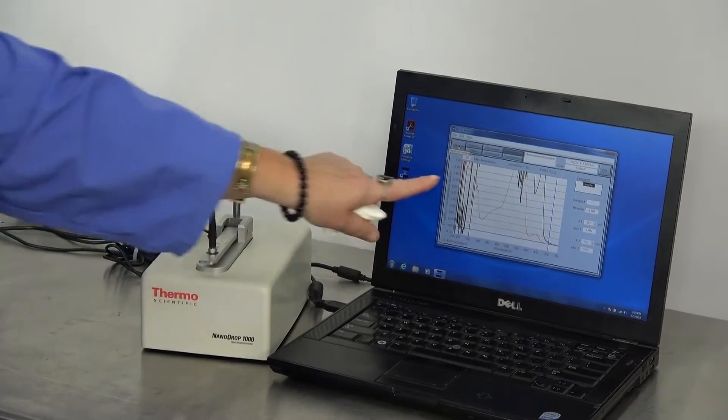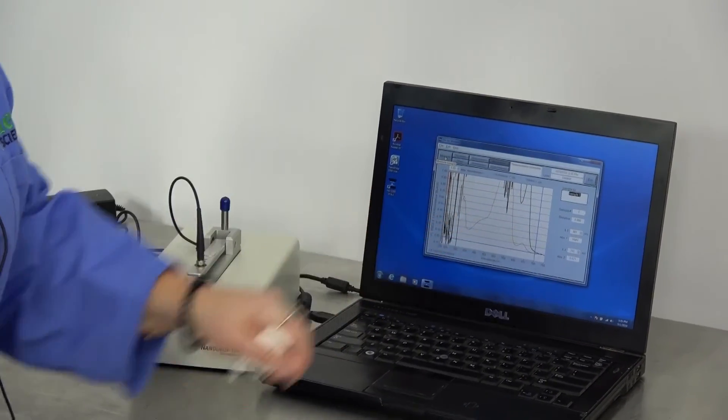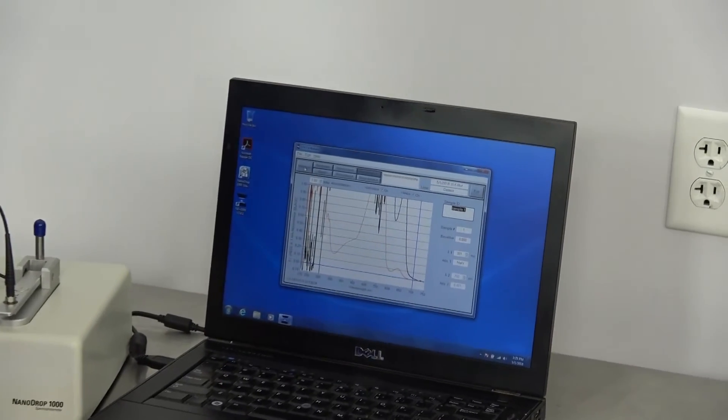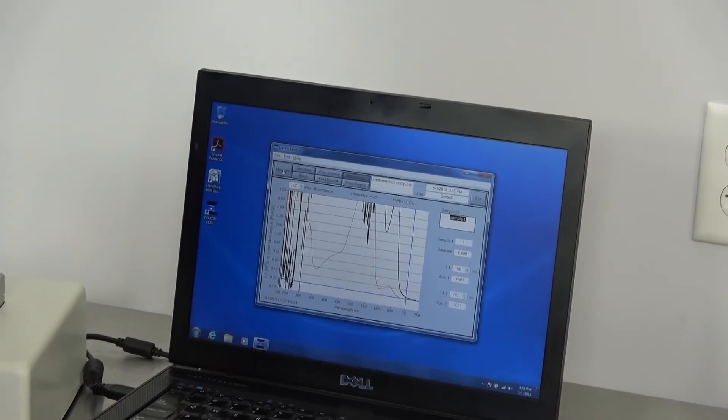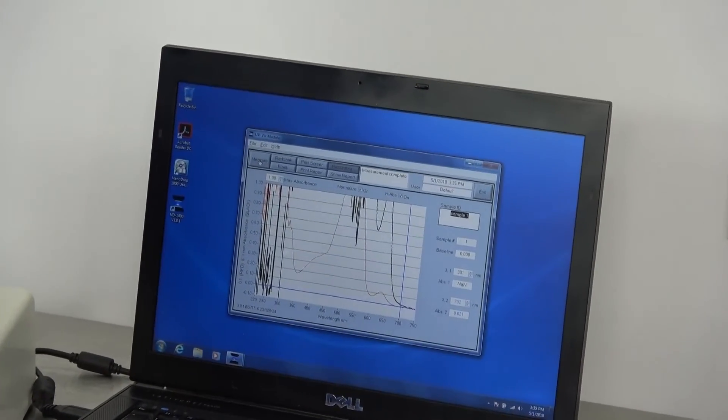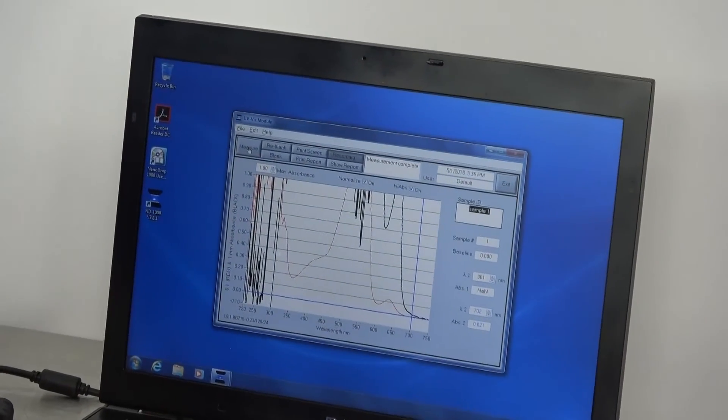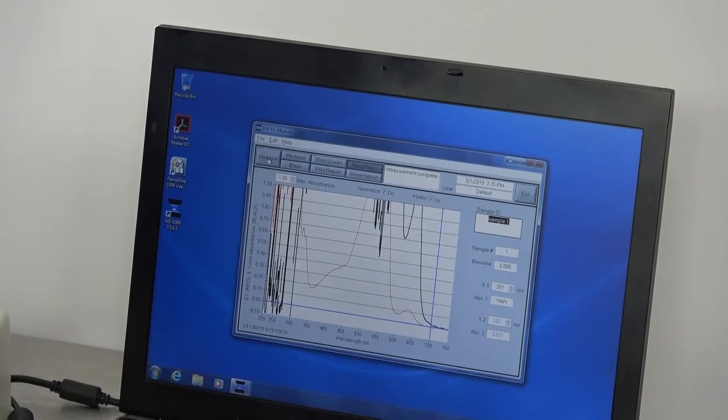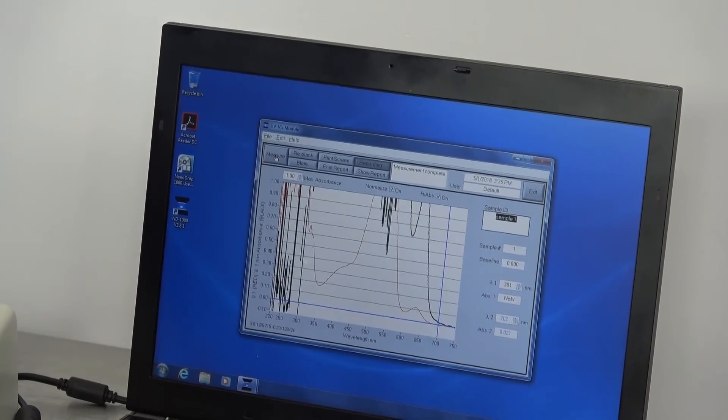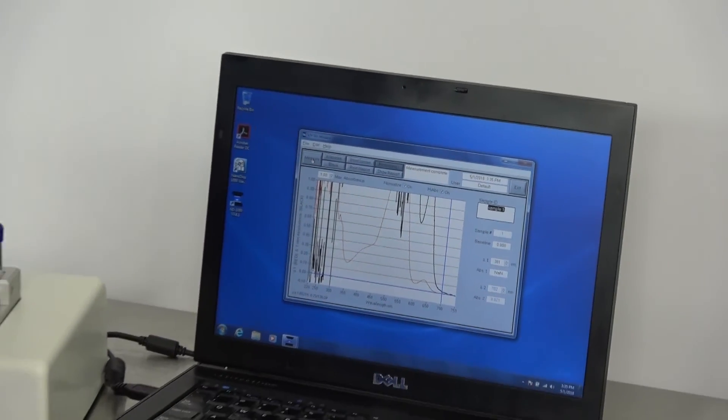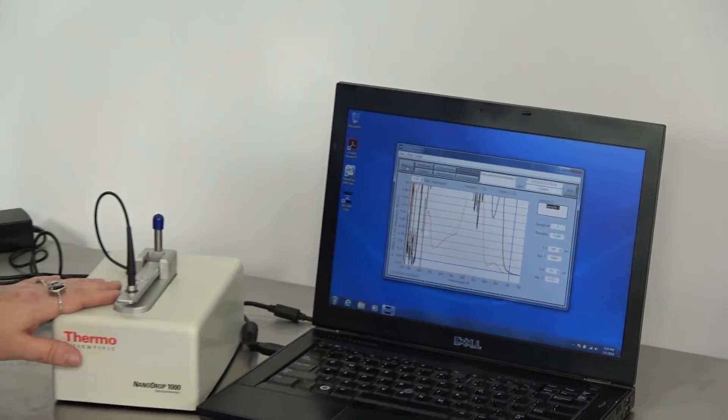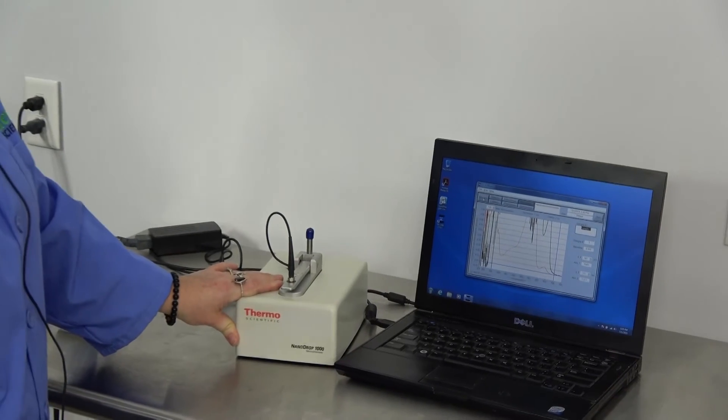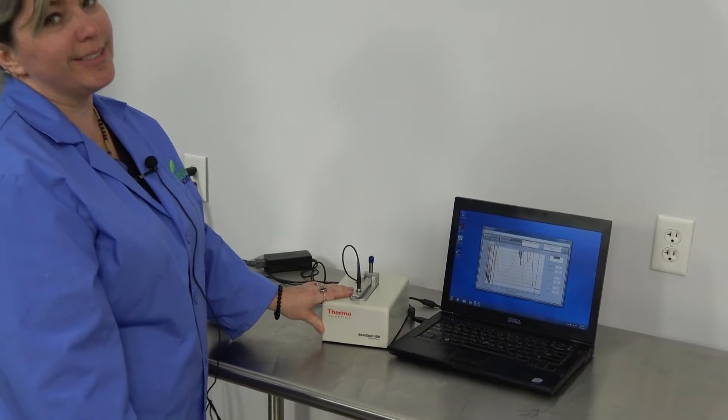And just that quick, you get results. All of our software has been checked, and our unit is demonstrated as being functioning, has been tested by our in-house techs, and it is in our possession in our Curtisville, Ohio warehouse.